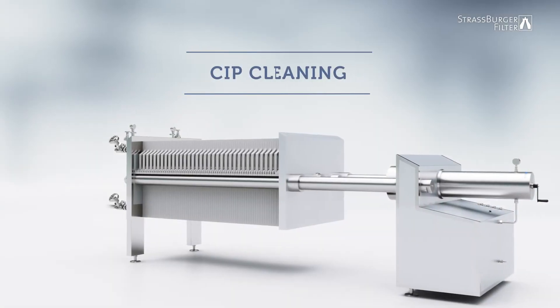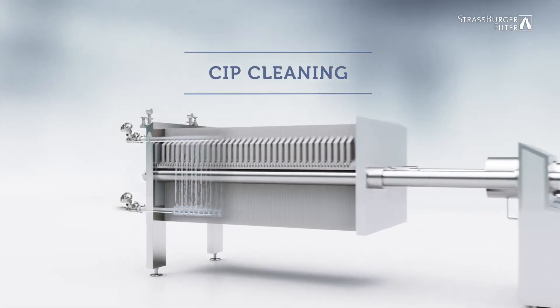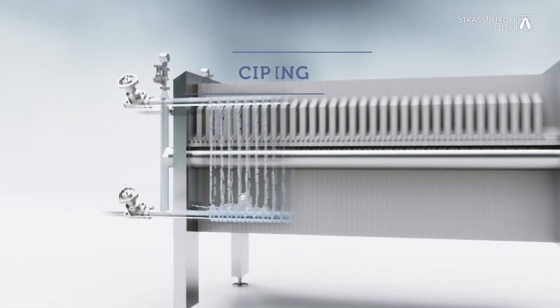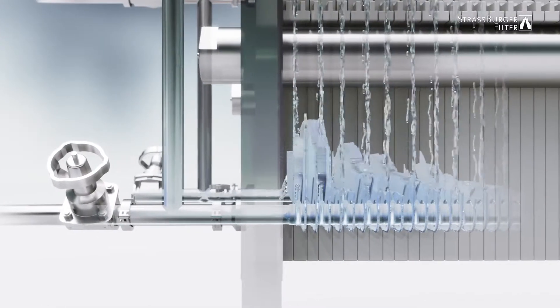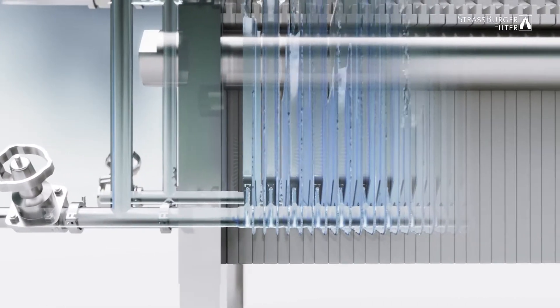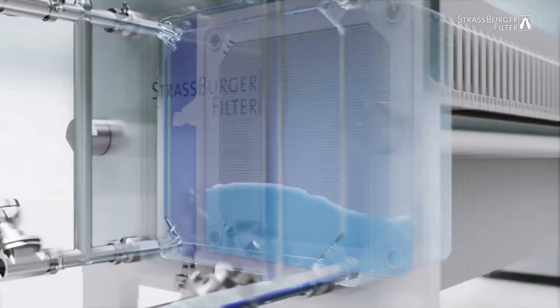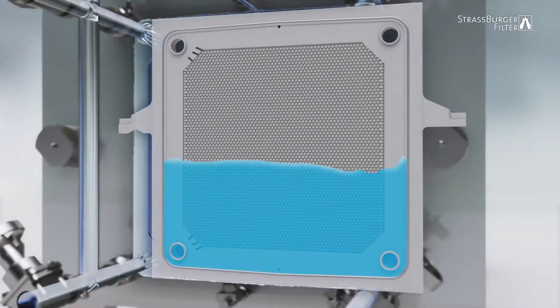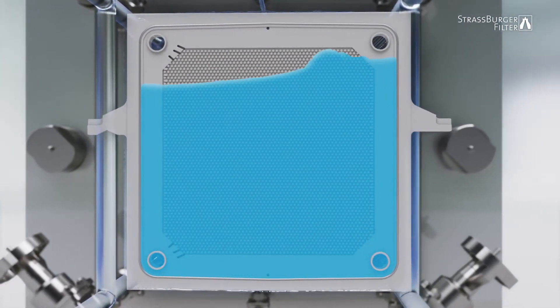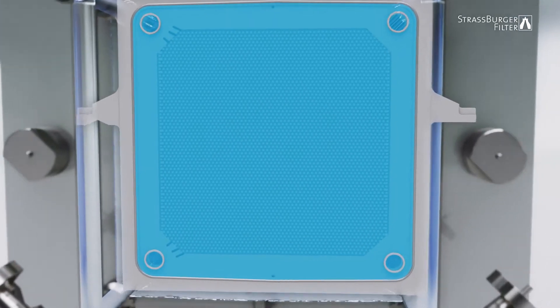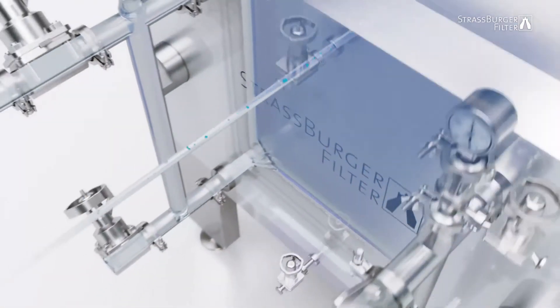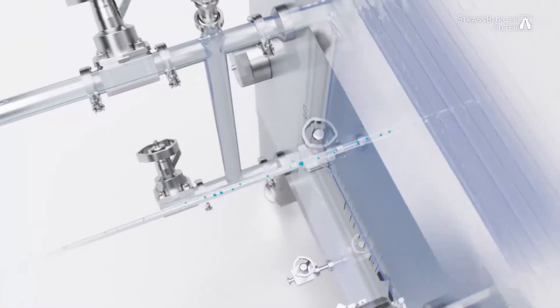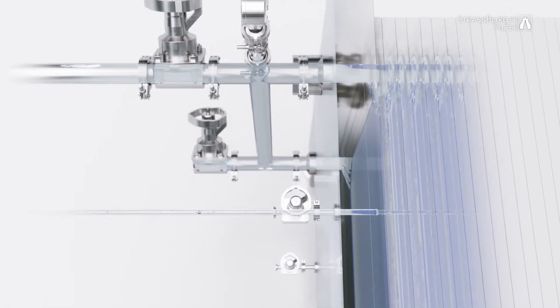For CIP cleaning, the filter is closed and all areas in contact with the product are rinsed with the cleaning solution. Any remaining air bubbles are discharged through the upper valve.